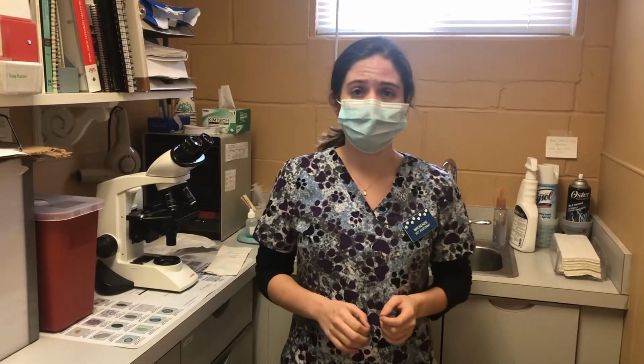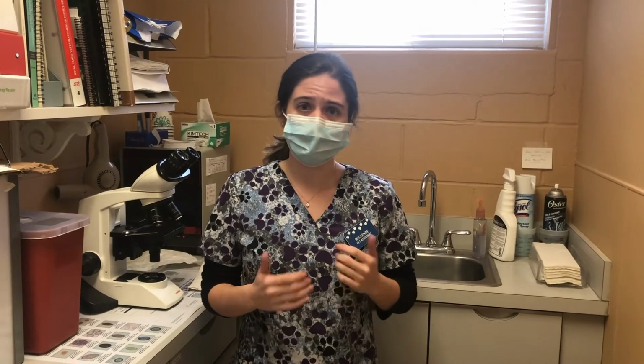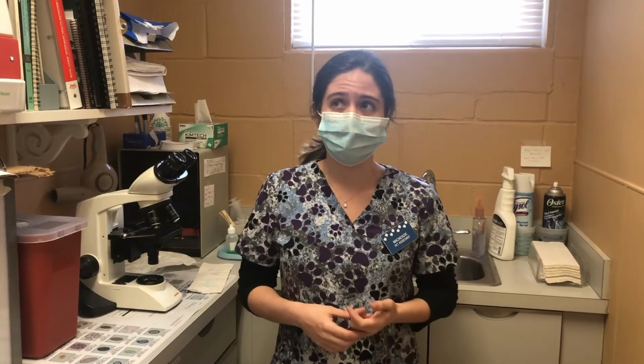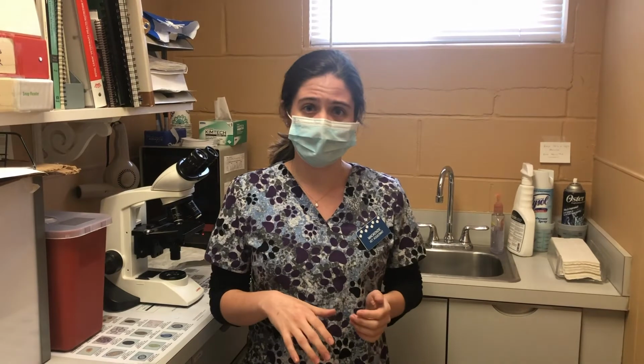Our next stage is proestrus. In proestrus, you're going to start to see some swelling of the vulva and some reddish discharge. And the female dog is starting to attract male dogs, but she's not going to accept them. And under the microscope, you're going to see some more of your parabasal cells and your basal cells. They're going to become more intermediate, start to get cornified, and you're going to see more red blood cells, hence the reddish discharge present.